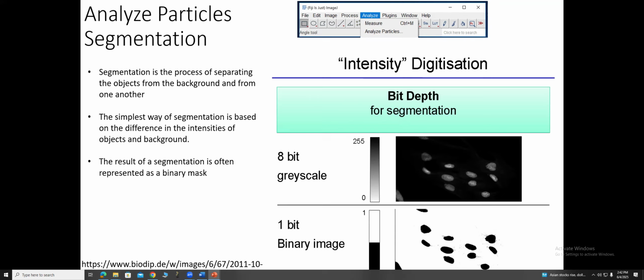So you're going to say, here is our 8-bit image. This was on a grayscale, 0 to 255, right? So you see that this is our nuclei here, right? And when we made the image binary, all of this background now is considered, this is actually not correct, it's inverted, right? But I don't know why they did it this way. You're making all the background 0 actually, and all of your signal 1.